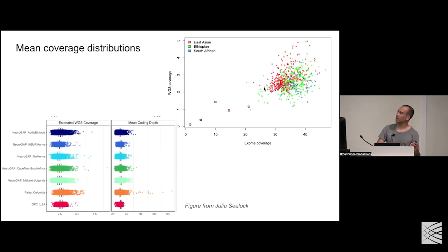This is just how it works in the wash of high throughput. But what we really want is to make sure we get enough exome coverage, capturing enough reads at at least 10x coverage, and then we get whatever else comes out. And as long as we have enough DNA in there, we don't want to get down to 0.